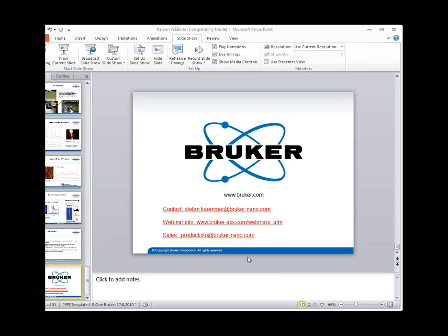Is there a test system available in Germany? Yes, there should be at least a NEOS-SENTERRA, so a co-localized system available in Germany. And you can just contact me or contact the product info webpage there. Just send me an email, then I can point you in the right direction here.